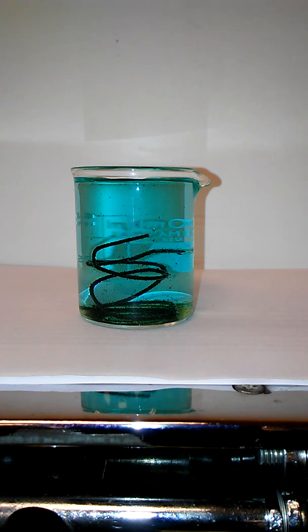This is fascinating to me, the amount of pieces that are falling off but then floating. I presume we're getting a gas trapped on the surface. It's possible there's just air bubbles trapped in there and they're being released now. The other possibility would have to be some kind of acid reaction, reacting with the metals and pulling them off. I can't imagine the light's enough to do heat and convection currents, though I suppose it could be.